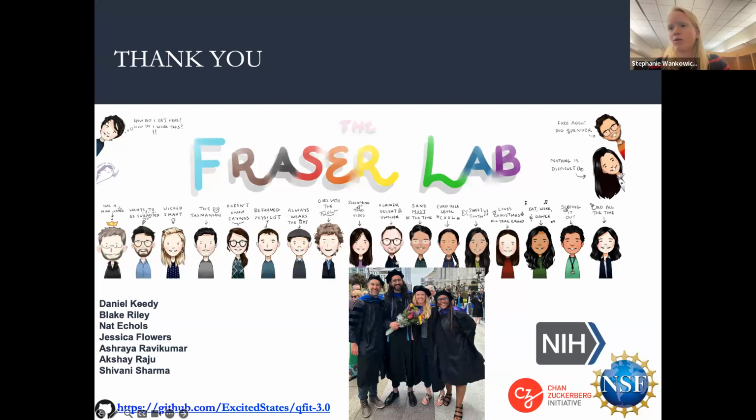And then the other thing is compositional and conformational heterogeneity and incorporating both of those. But I couldn't point to a dot on that graph and say this is exactly the reason why. It just tends to be that there are some models that get worse, and we cannot fully pinpoint a pathology of that.